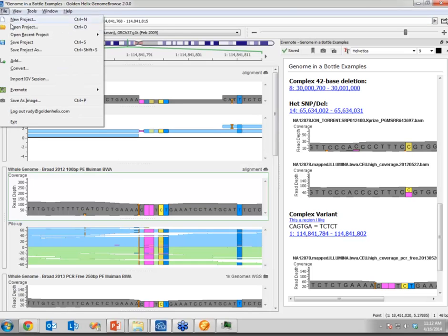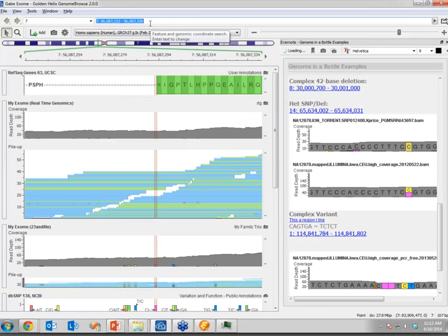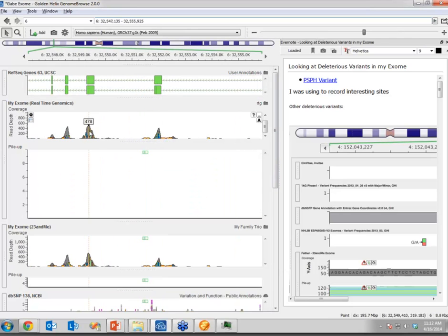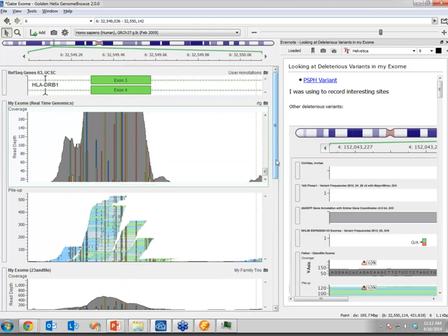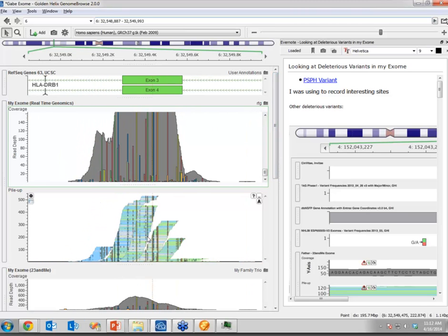And if you look at HLA, I'll go back to my exomes real quick. It's a complete mess, and it's not something that we can blame on the variant caller. So HLA-DRB1, right? There's just no way that you're going to pull across the 10 different pseudogenes that are accounting for the variable height in this histogram of read depth and mismatches and all that. So there's really a totally different class of problem. So a little more time than I need to spend there. Yeah. Let's see.